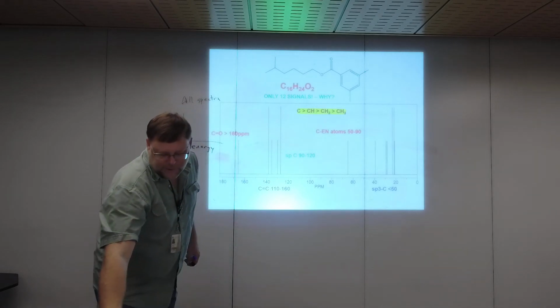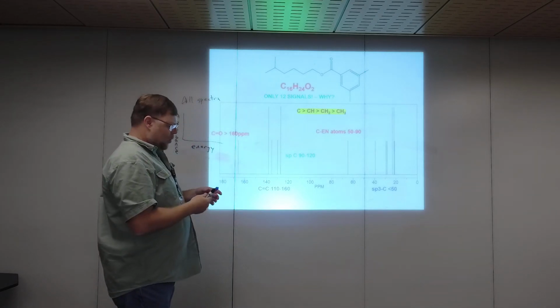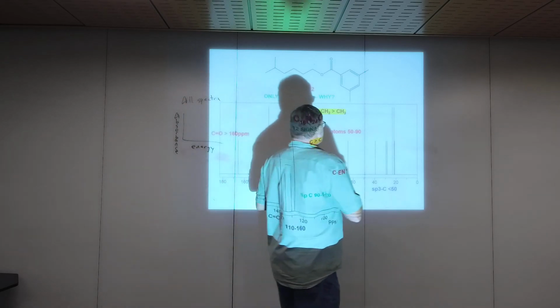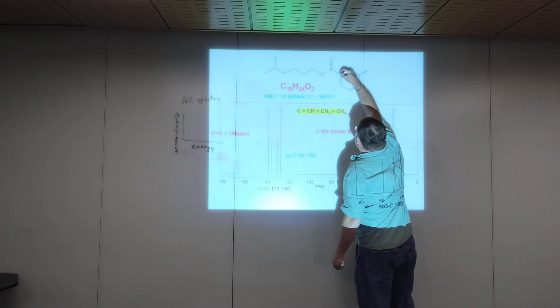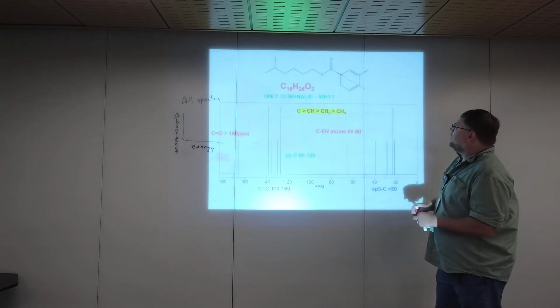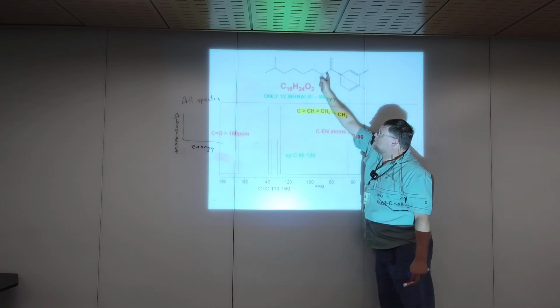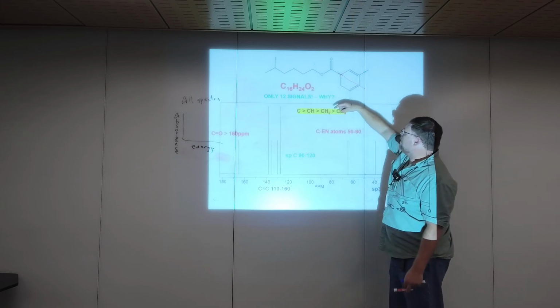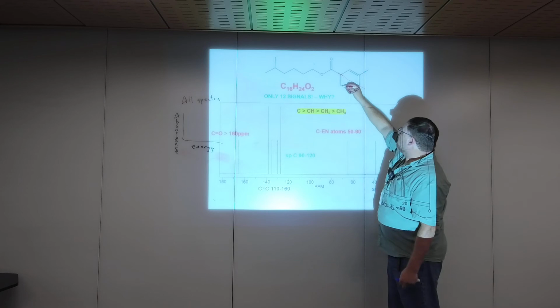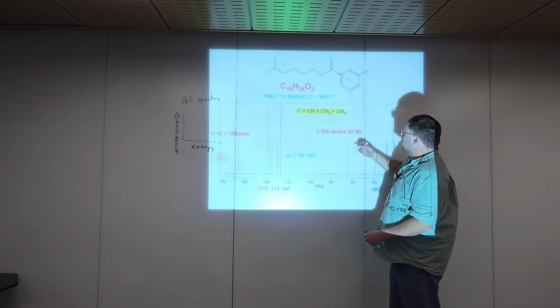All right, here's our original molecule. Let's look at our planes of symmetry, like what's the same. So we get a plane of symmetry here, line of symmetry there. And again, this single bond rotates freely. So this whole thing is sometimes up there, sometimes down here. But basically, these are the same, and the methyls are the same. It's exactly the same as the last one.